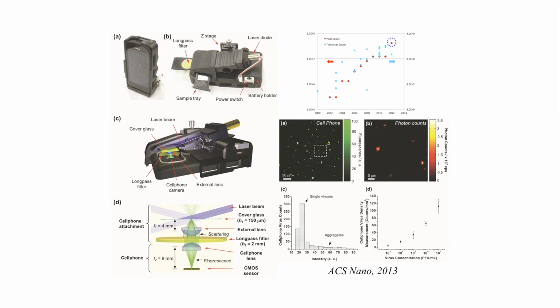These are some viral particles that are being compared to a confocal microscope. So now the comparison is essentially a photon counting confocal microscope. And that is enabled by essentially Moore's law, helping us, even though it's very compact and cost-effective, the performance that's embedded in the cell phone is very unique and very powerful to give us unique imager designs, unique microscope designs, and sensor designs that could be essentially leveraged in field settings.